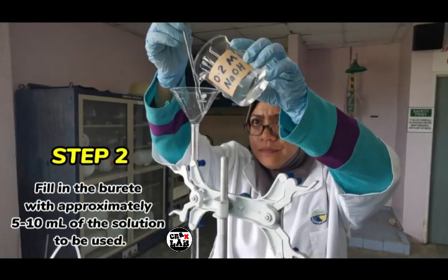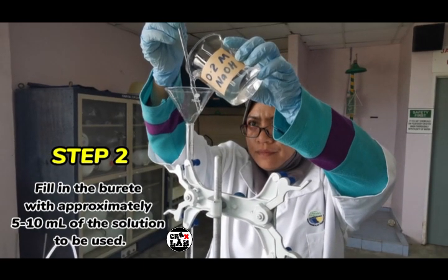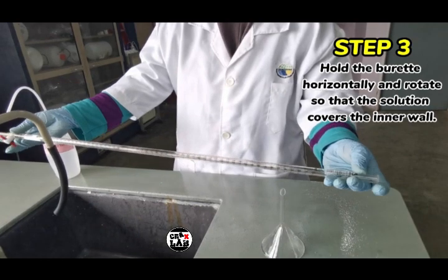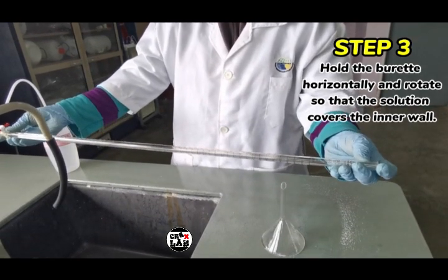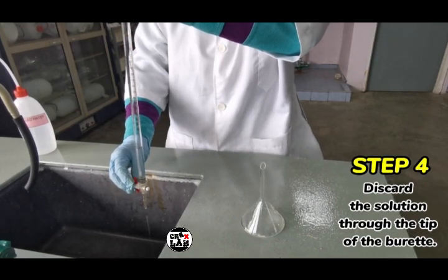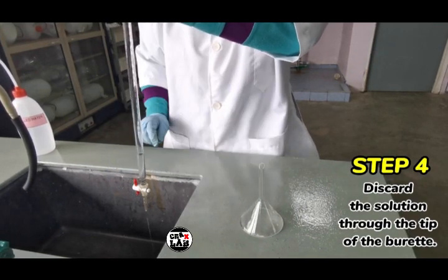Step 2. Fill in the burette with approximately 5 to 10 ml of the solution to be used. Step 3. Hold the burette horizontally and rotate so that the solution covers the inner wall. Step 4. Discard the solution through the tip of the burette.